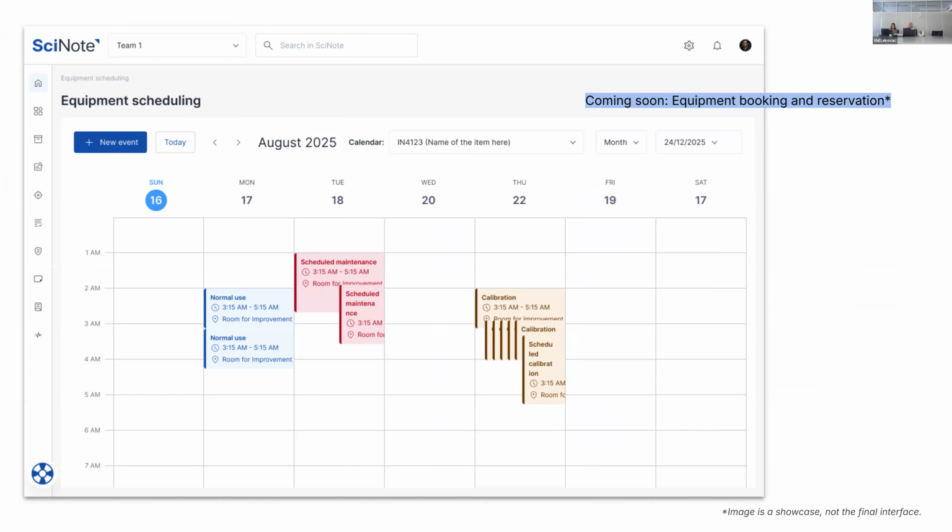Good. Okay, this is something new. It's going to come out in a few weeks, months. I'm not going to say the exact date because the product team will be mad at me. But it's already in the development pipeline. So we are working on equipment booking and reservation. There's going to be a calendar, and this is a screenshot. As you can see in the bottom right side, it's not the final interface, but this is a direction we're going into. So you're going to be able to have calibration dates and also booking of devices. Let's say you have a certain device that people book for 2 or 3 days. Yes, you're going to be able to do that, and you're going to see this information in the calendar. And all of this, again, will be timestamped and time tracked, so you're going to be able to find this information.